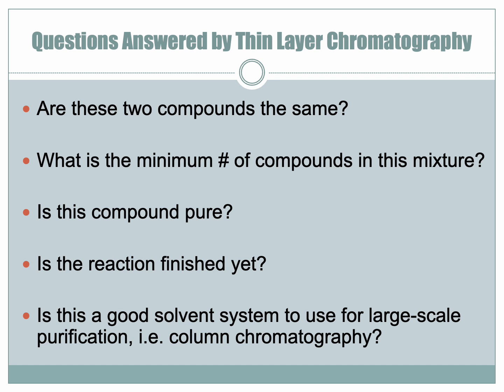Okay, so questions answered by thin layer chromatography. We can answer, are these two compounds the same? If we have two different compounds, we can use TLC to answer that question. We can use it to answer the question, what is the minimum number of compounds in this mixture? We can answer the question, is this compound pure? Is the reaction finished yet? Is this a good solvent system to use for large-scale purification?